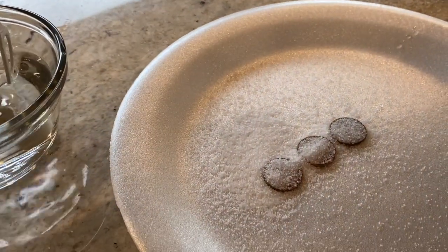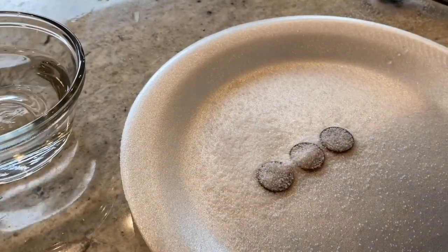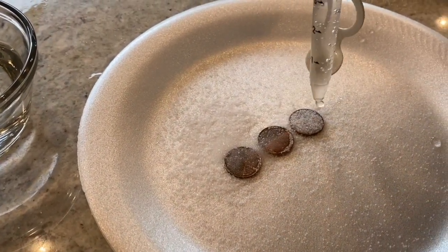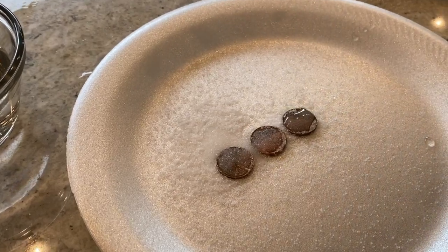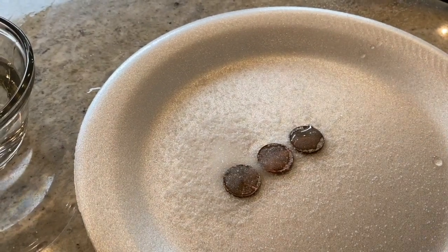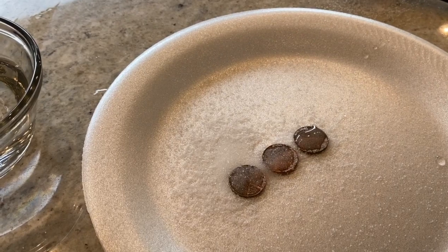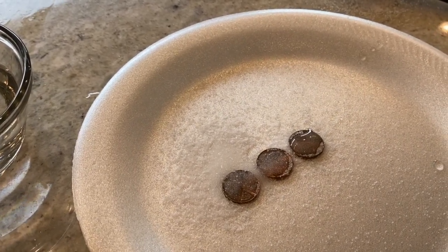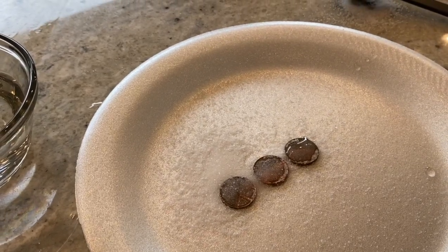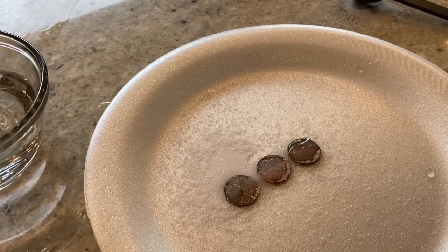With the eyedropper, we're going to add a few drops of water to just cover each penny. We're going to allow these pennies to sit for a few minutes, then blot them with a paper towel so the pennies are exposed to the air and let them sit overnight. We'll come back and observe how they look tomorrow after sitting overnight exposed to the air, and we'll record that in our notebook.